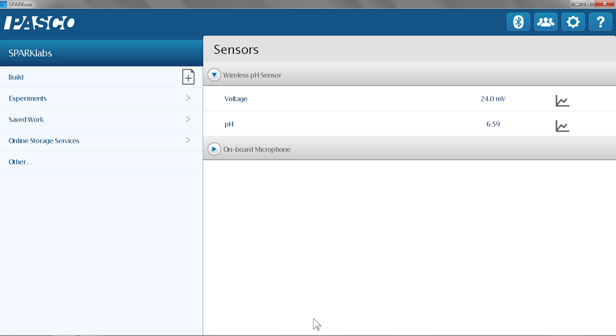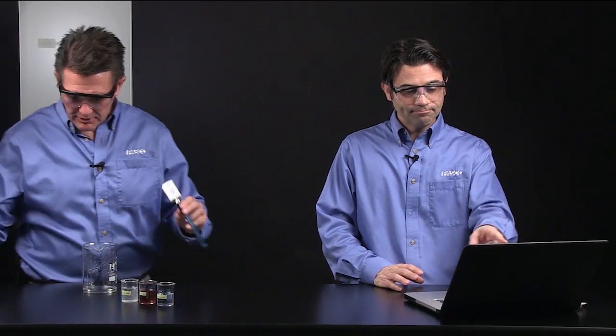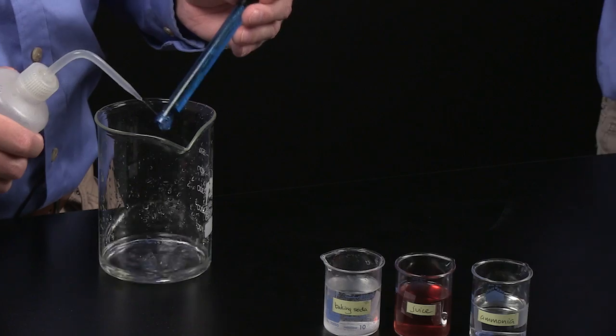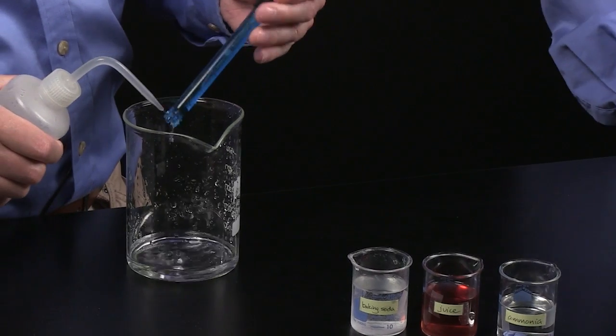And now, once I am connected or paired, my sensor measurements will appear right on the home screen. I'm going to rinse off the storage solution. The bulb at the very end is a little bit porous, so I want to use a little bit of force with the water to get it off. Then I'm going to place it into a baking soda solution.